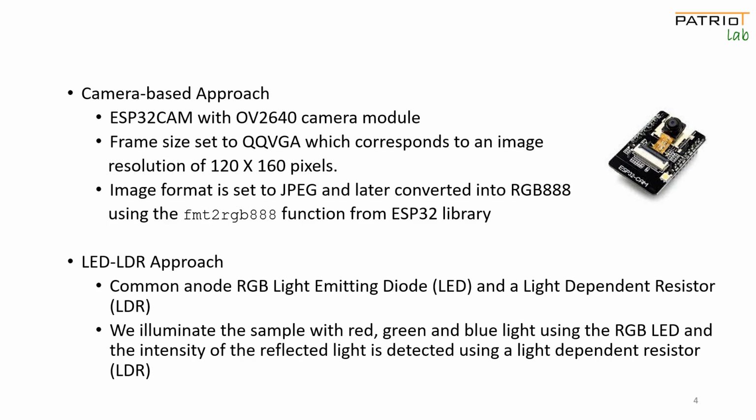The intensity of each color component was determined relative to a 2-point calibration using white and black color to compensate for any experimental variations.